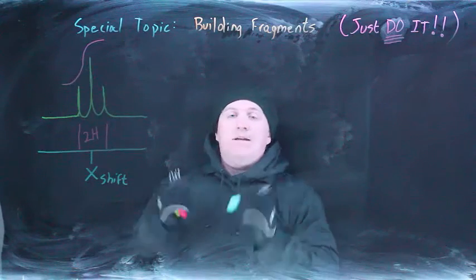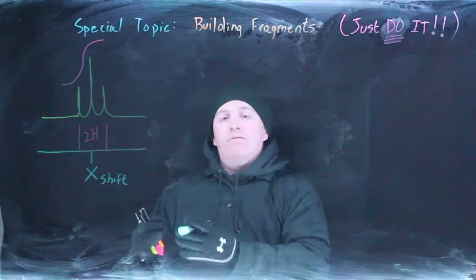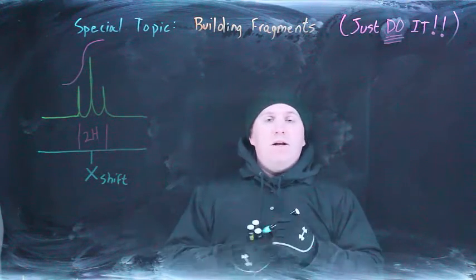Even if you are exceptionally good at NMR, this is the systematic way to approach it. This is the algorithmic way to approach things. You absolutely want to work this way if you can. And what do I mean about building fragments?